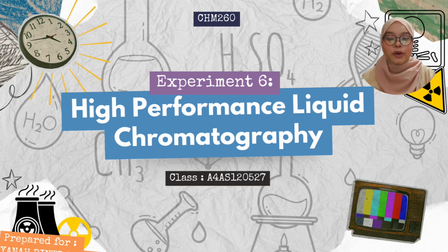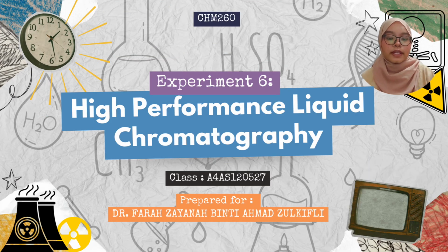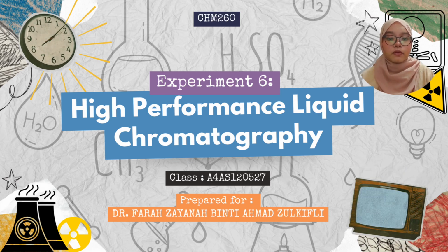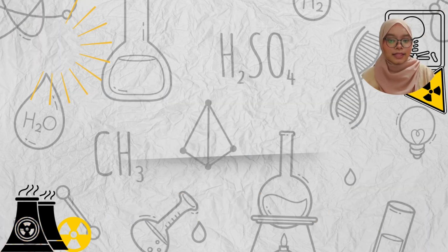Hi everyone, we are from A4AS120527. Today we will present about experiment 6, which is high performance liquid chromatography, or known as HPLC.